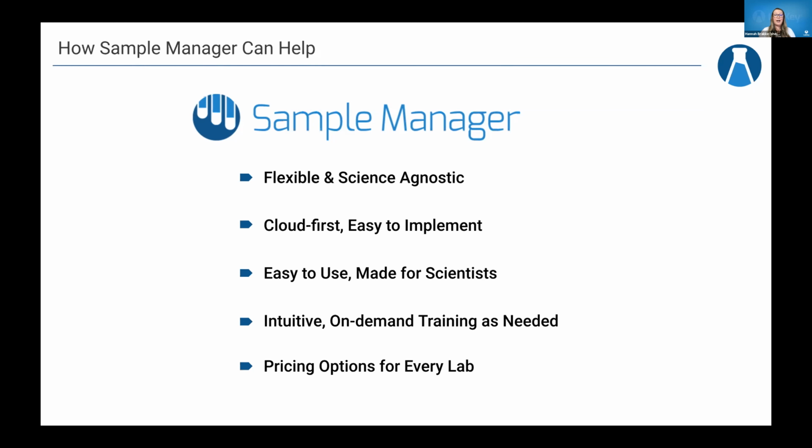And if resistance to change is something that you're encountering, which is in there quite a bit, head back and listen to Gaurav's talk and the following panel from Monday's discussion, because I think they had some really good points there. Starting small, being able to tackle bits at a time. And I'm going to speed up here because I know I'm over time. But really, we have designed Sample Manager to be easy to use. It was designed by scientists for scientists. And so hopefully that helps provide that necessary activation energy that you need to get teams on board.